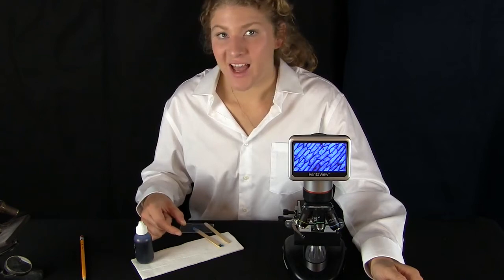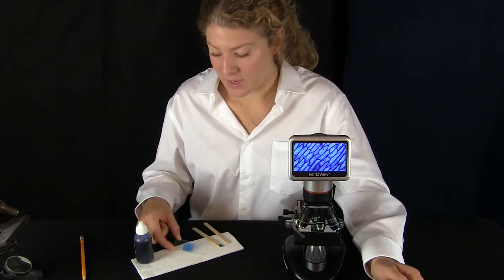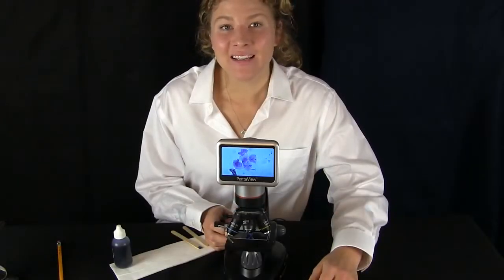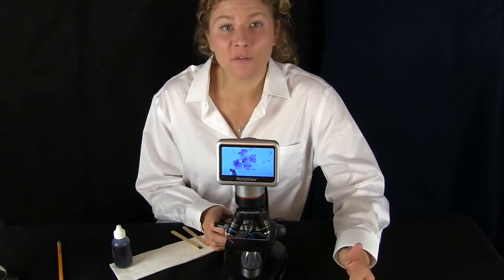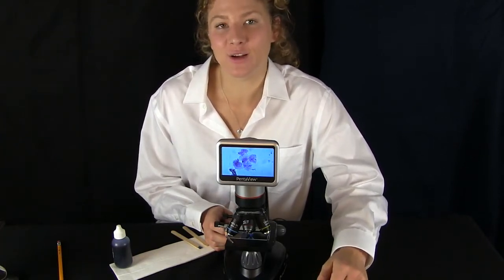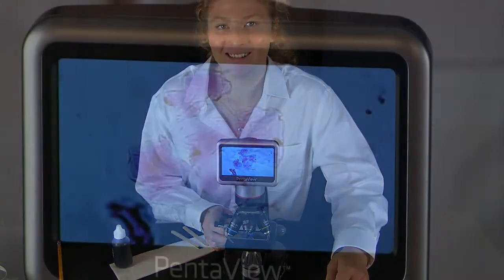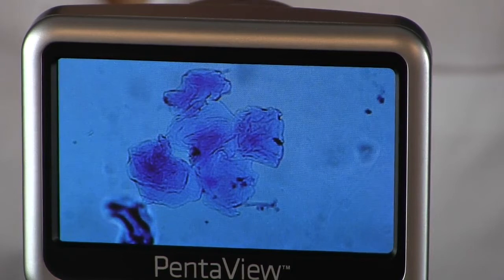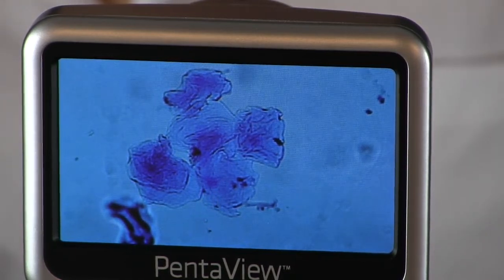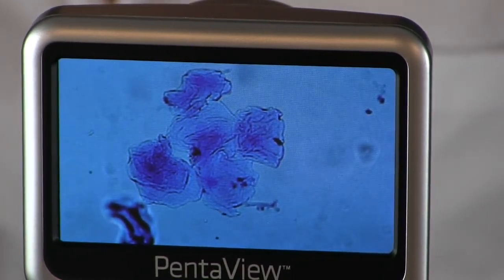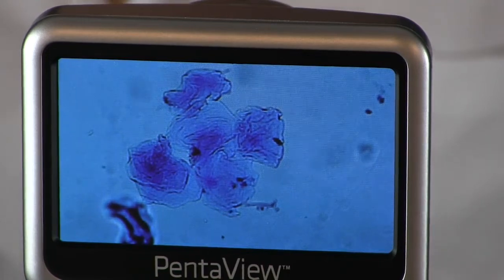I think I got some cells, so now I'm going to put the cover slip on top to keep them all in the same place. Here is my finished slide with my cells, and now we're going to put it under the microscope. Wow, look at my cells! It looks like there's about four or five cells here. We're going to zoom in to take a closer look. We've zoomed in, and if you look closely at these four or five cells, you can see the dark dot, which is the nucleus. Isn't that cool?